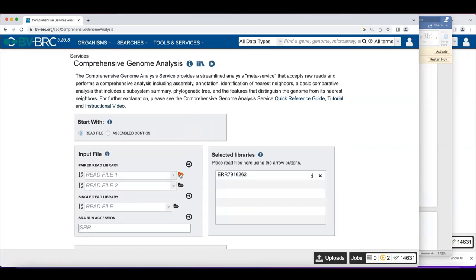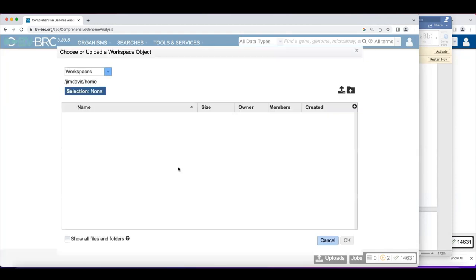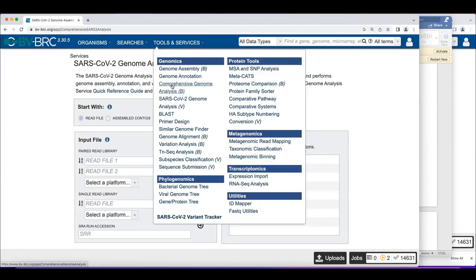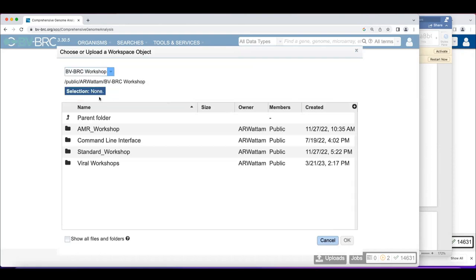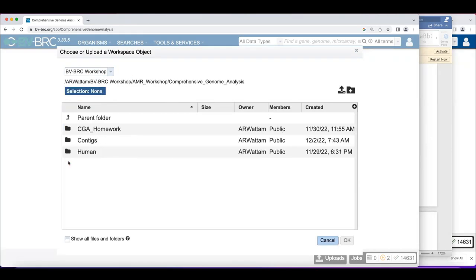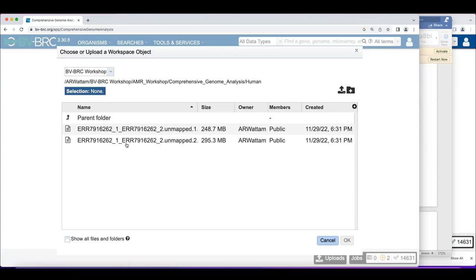There's one more example to run. Earlier in the workshop there was a FastQ Utils demonstration where Rebecca aligned reads against the human genome to separate human reads from bacterial reads — we want the ones that didn't align to human because those are the bacteria. Conveniently she's saved those in the workspace, so we'll go back and find them.